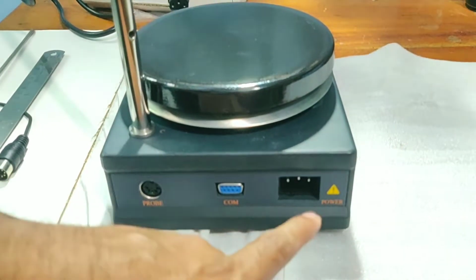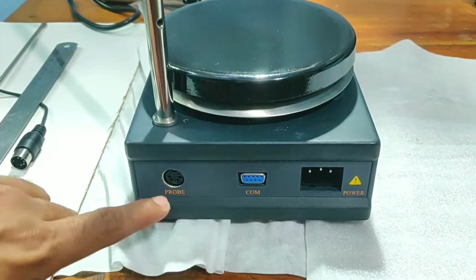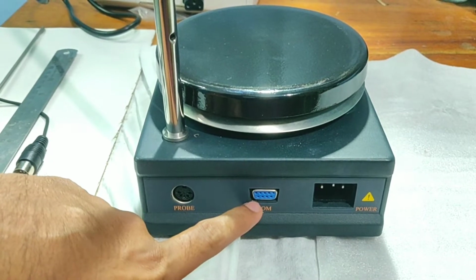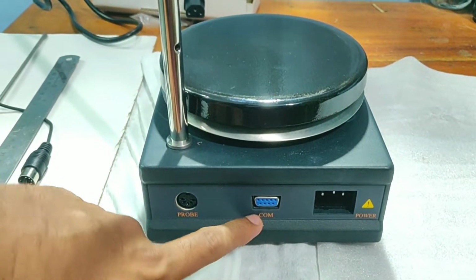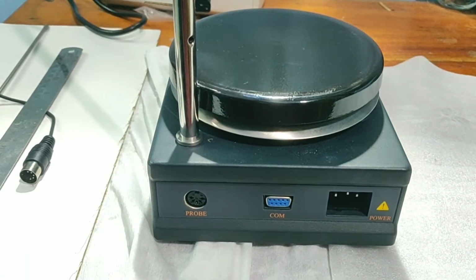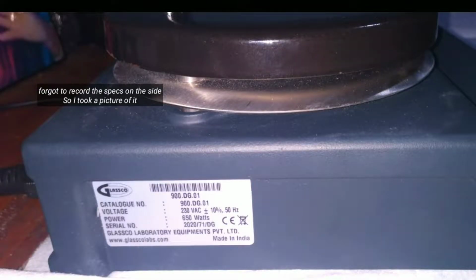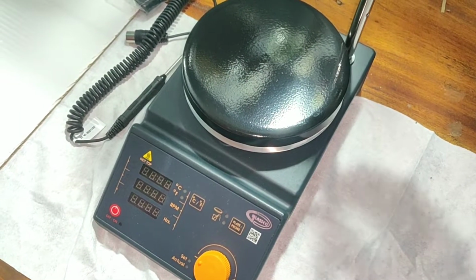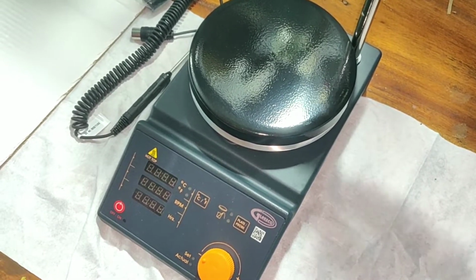Now let us see the back of the hot plate. On the back we have 3 ports, one for the power cord, another one for the temperature sensor probe, and the center one for connecting to the computer for programming purposes. On the side there is a small hole for placing the stainless steel rod in it.